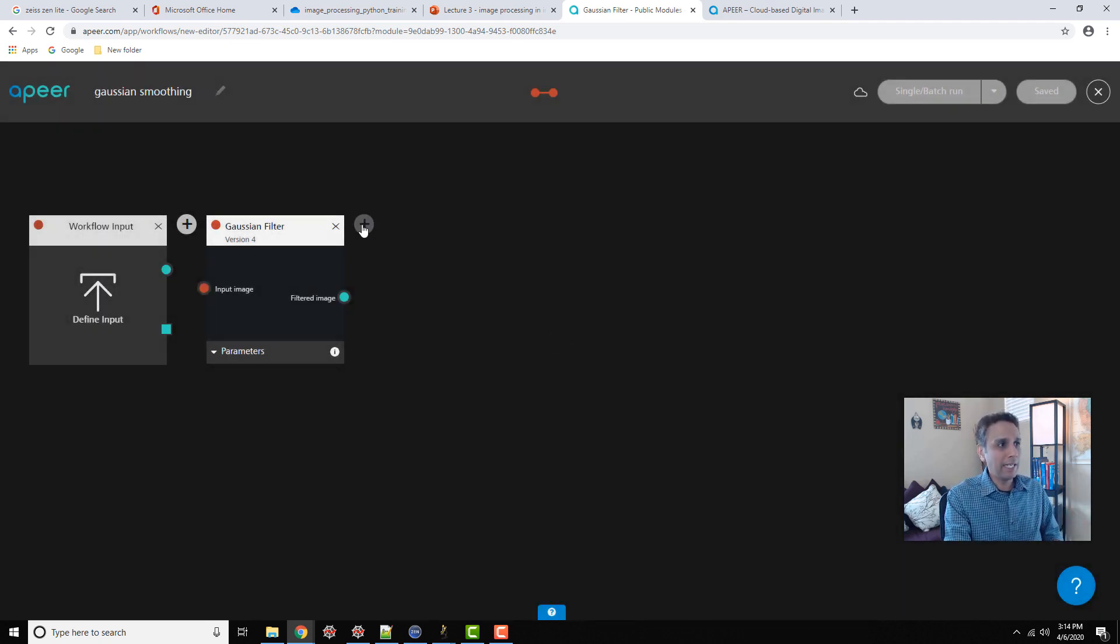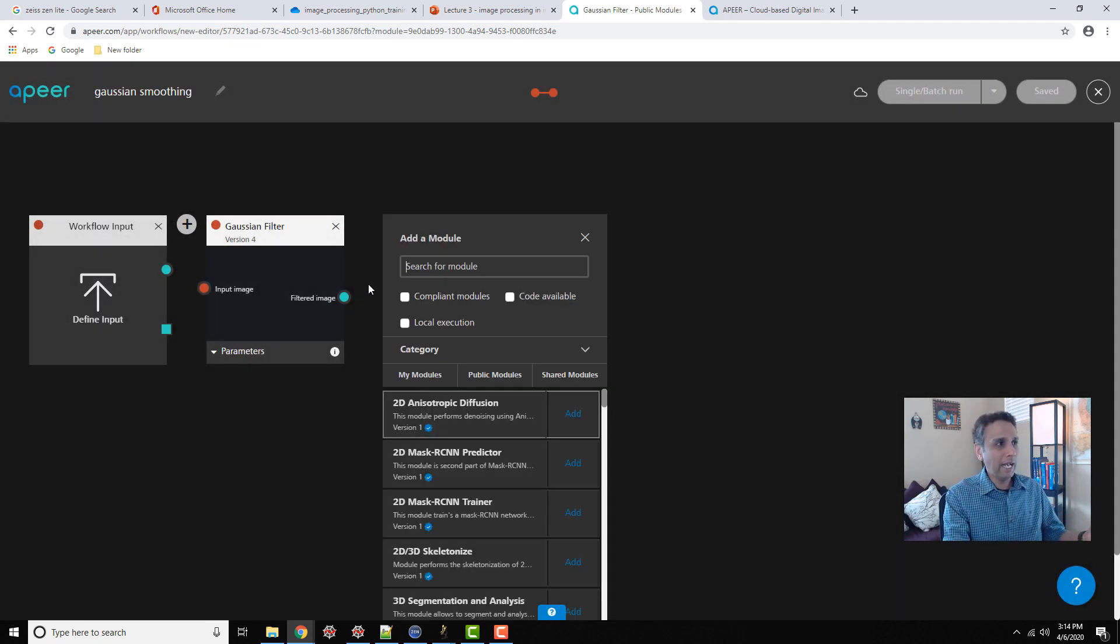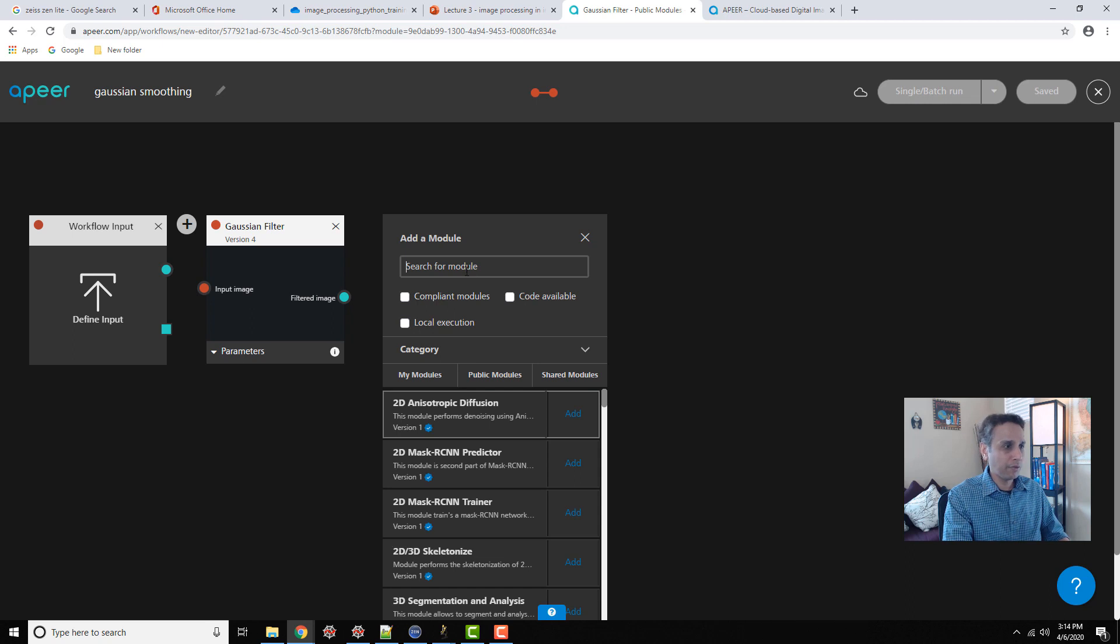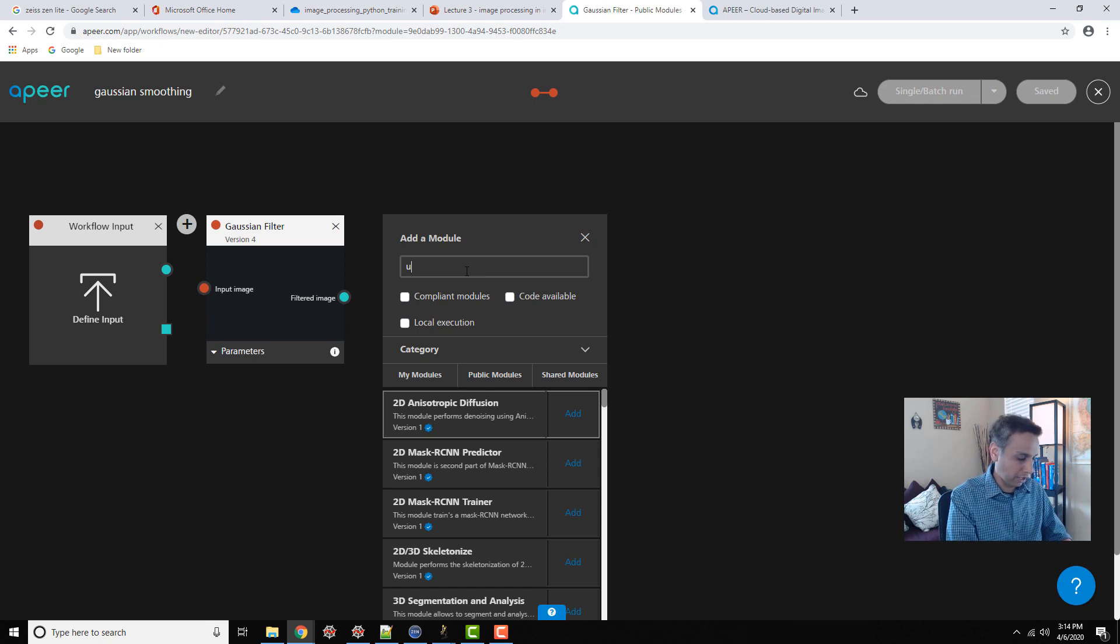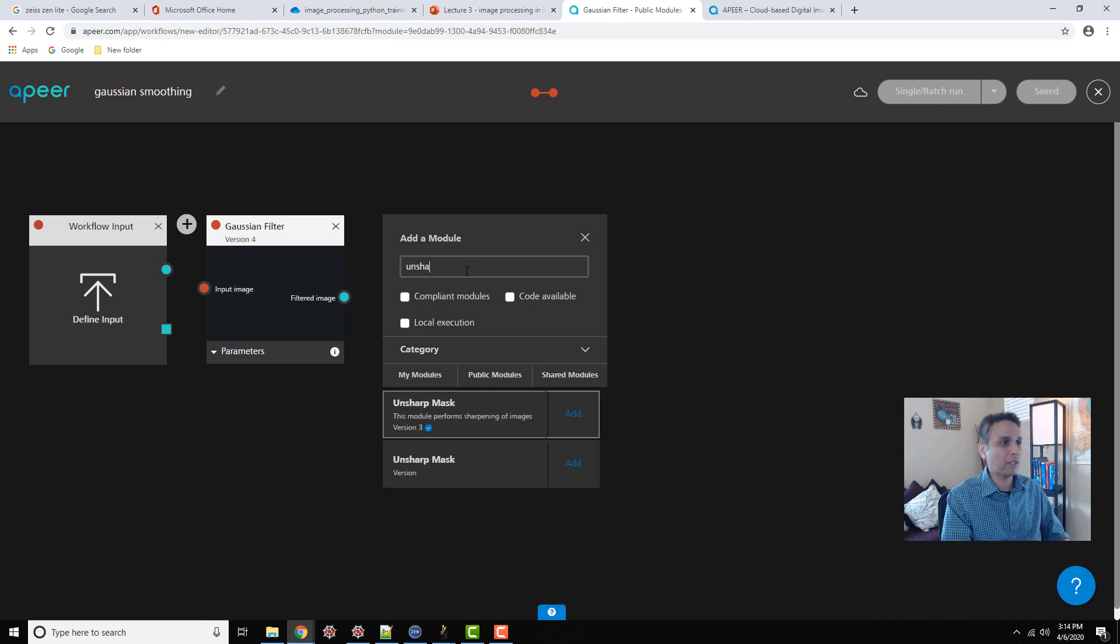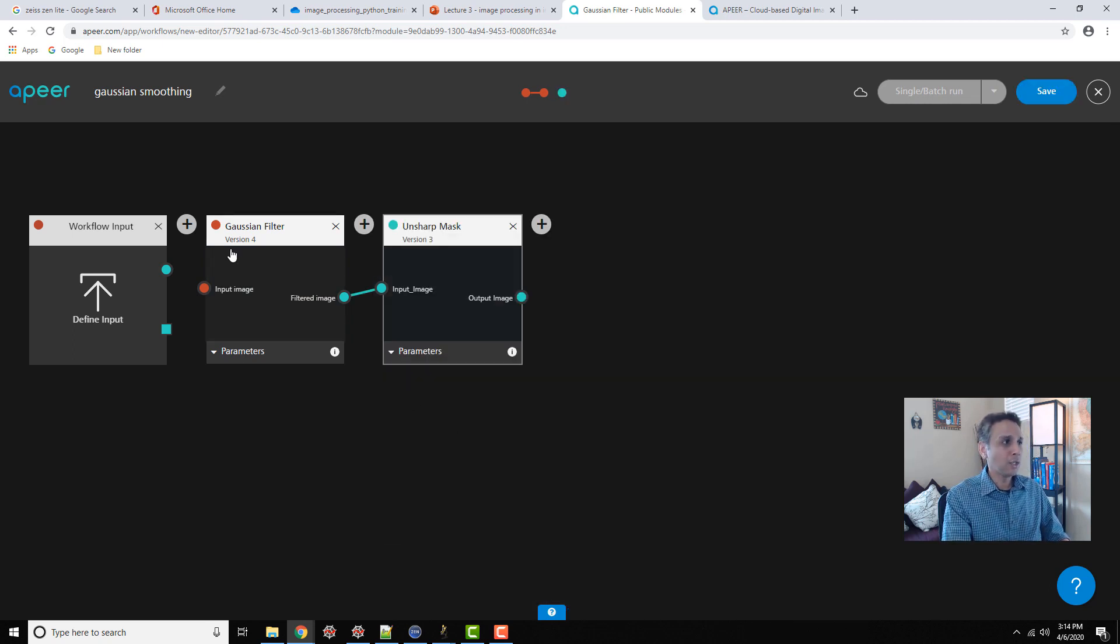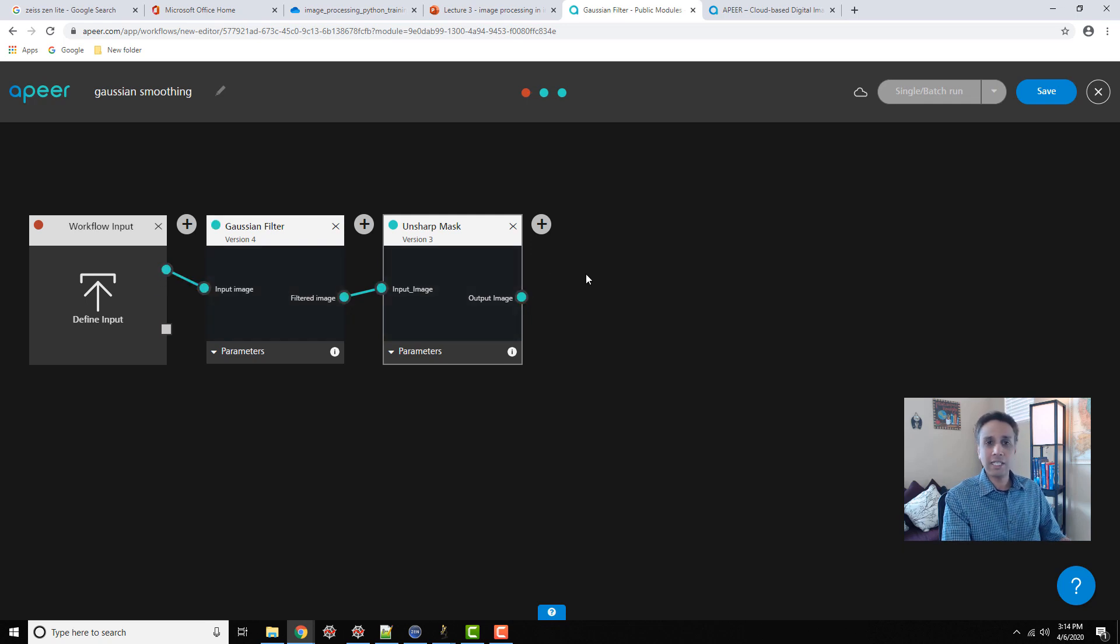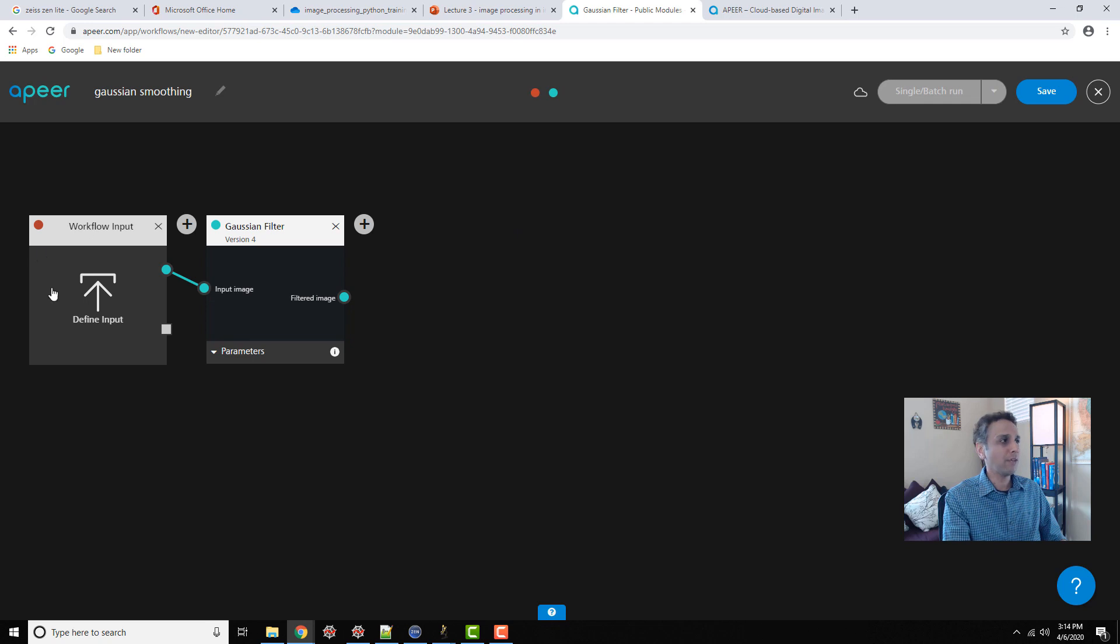Right now, I'm taking individual elements and creating a workflow. In this example, I have only one, but you can imagine adding another one. After the Gaussian filter, I want to perform unsharp mask or something. You can just go ahead and add these, and that's how you create a workflow.